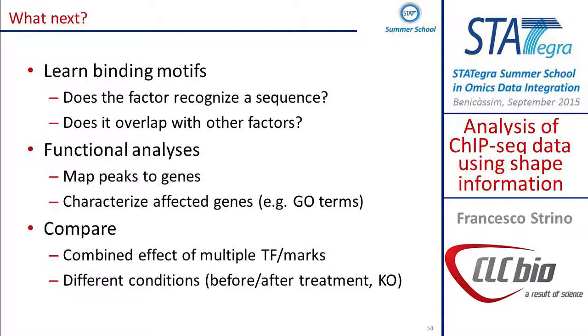And that's also very fast, because if you don't want to do a ChIP-seq of 100 factors, you can just look at the sequence instead of running all the peak calling for all the factors and seeing how much of the regions overlap. So this is also quite a fast analysis.